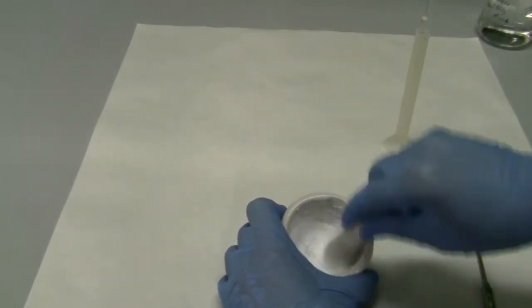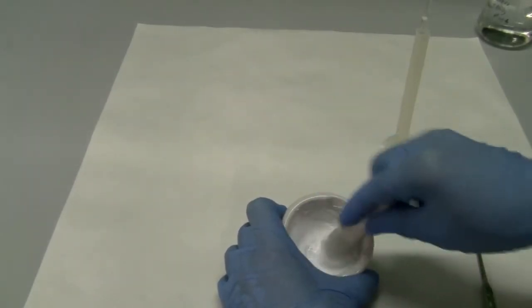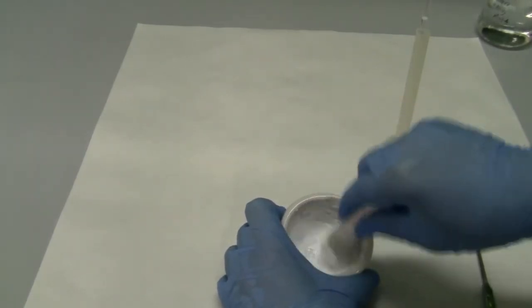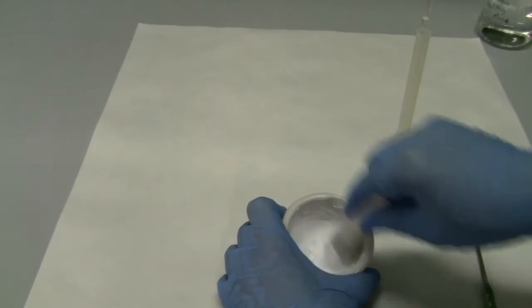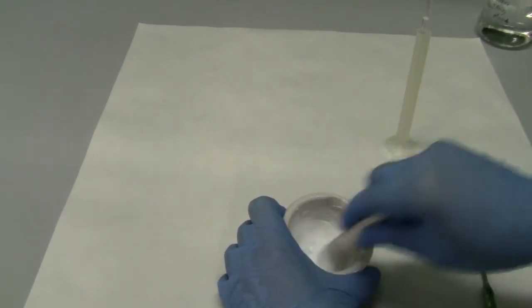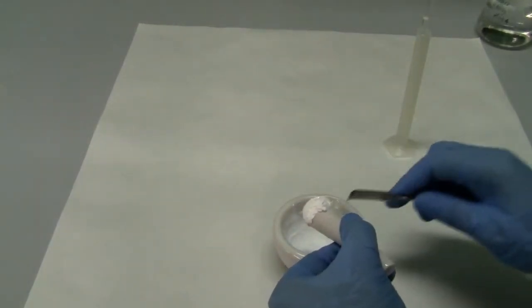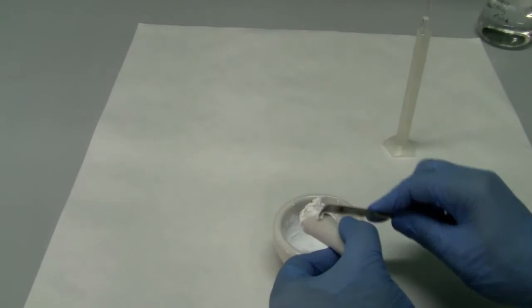At that time, we can also see that we need to remove from the pestle and from the mortar walls part of our paste, otherwise it will be left away from the homogenization. This is crucial to have only a homogeneous material.